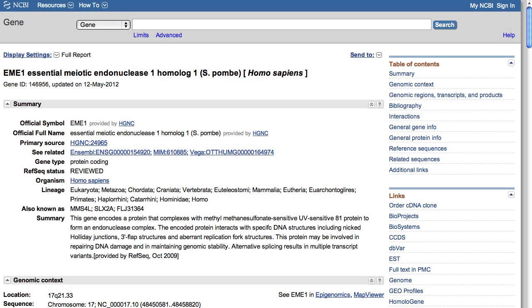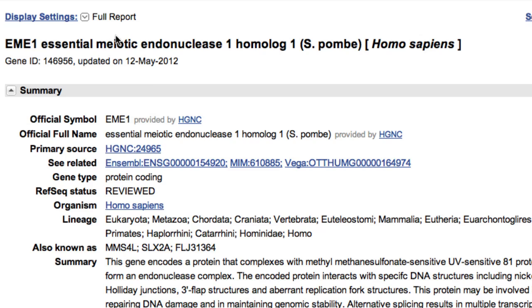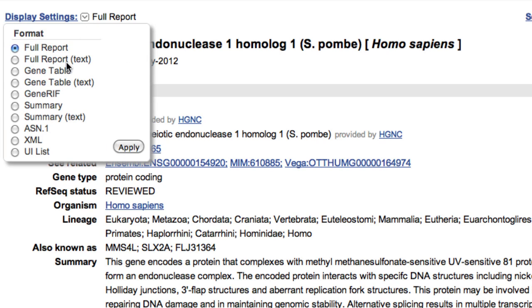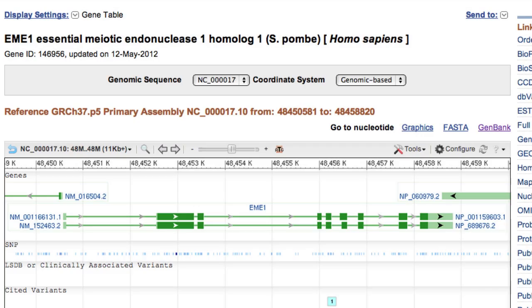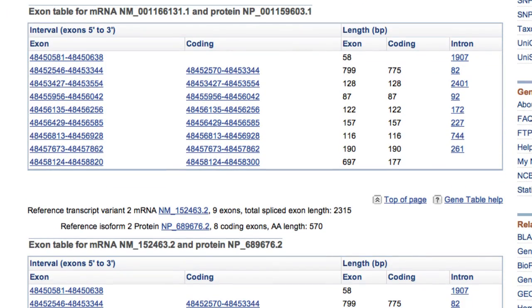Another way to get genomic sequence — for example, just a UTR or an exon or intron — is from the gene table display. Go back to the top of the gene record and change Display Settings to Gene Table. The ranges shown in the tables, one table for each transcript, are links to the sequence. Note also the link to the very helpful Gene Table Help.